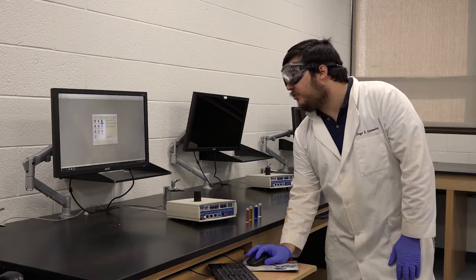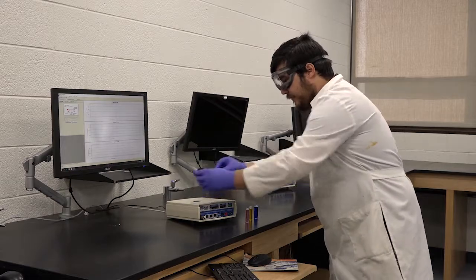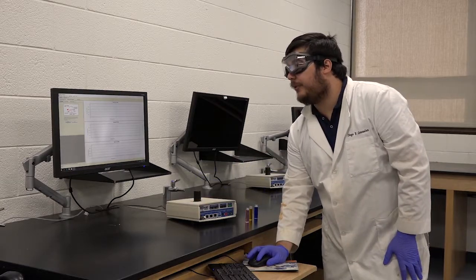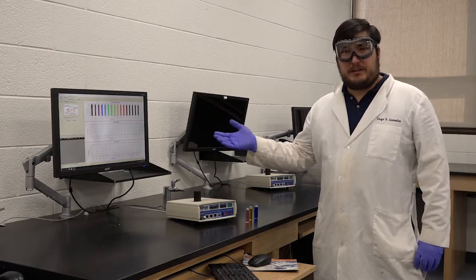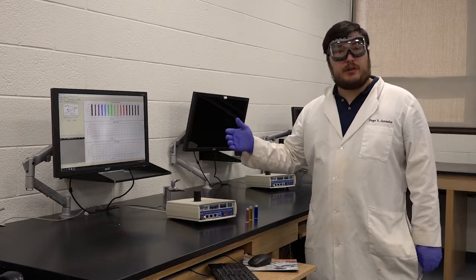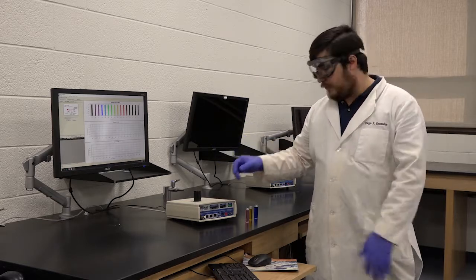So we choose the color comparison, and we're going to do the reblank as we've done before, hitting the read blank button. Now we give a couple of minutes for this to finish. Now that our spectrophotometer is blanked, we can add our different primary color solutions to the machine and add them into the program.